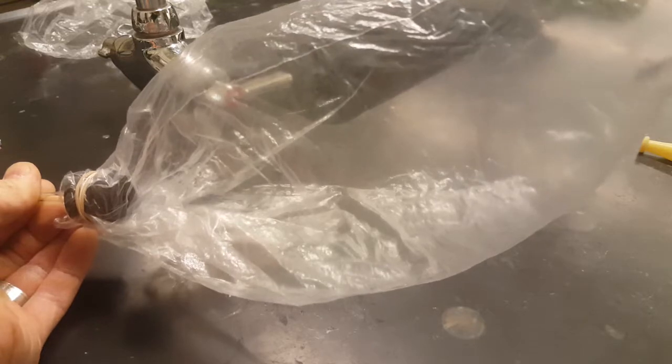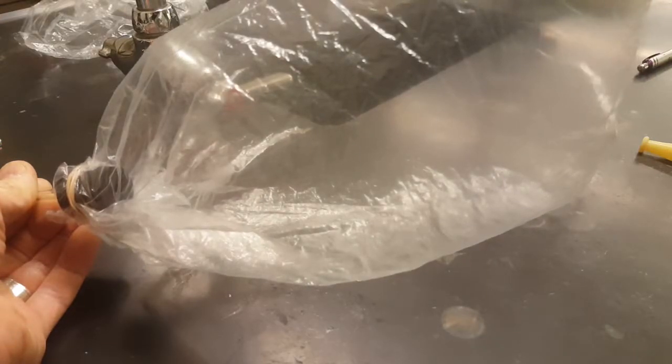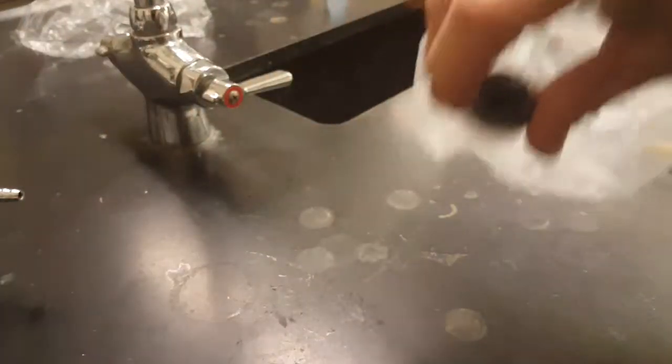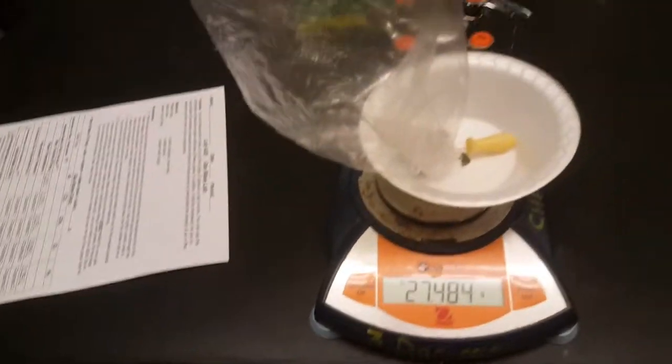So I'm just filling the bag until the bag is as full as it can possibly get. And for each of these gases, you want to fill your bag the same amount for each of the gases. That's going to be one of your controlled variables. All right, that's as much as it'll fill. I'm going to stop my gas, plug the hole, and cover the stopper. Bring it over to the scale again. Of course, zero the scale and place the bag on there, with the heaviest thing on the bottom, which will probably work best, and find the mass of your methane. It should be different, hopefully, than the mass of the bag and the stopper and the plug.